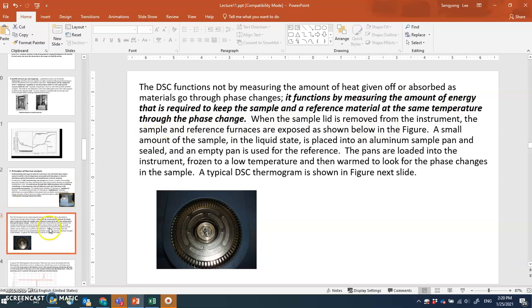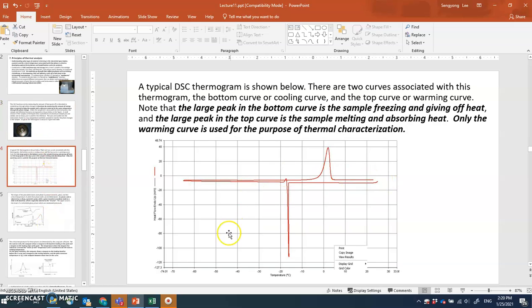Okay, so what you're going to see is this kind of graph out of your DSC analysis. So temperature change here, and then heat flow, what kind of energy is evolved or taken up, that's what you're observing. So if you bring down the temperature, freezing, you see one big energy release, because when you are freezing your material, it's losing its energy, giving up the energy to outside.